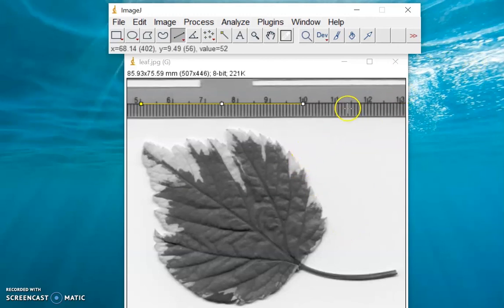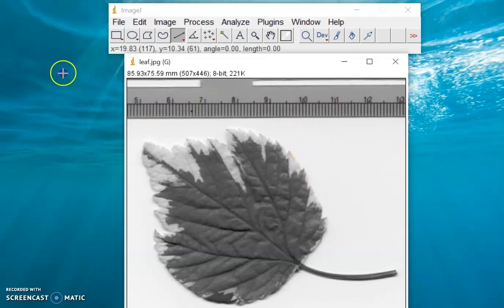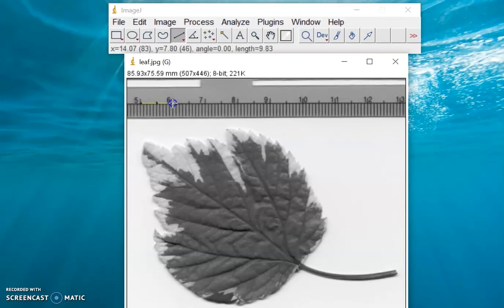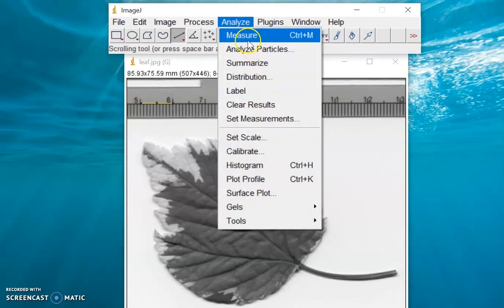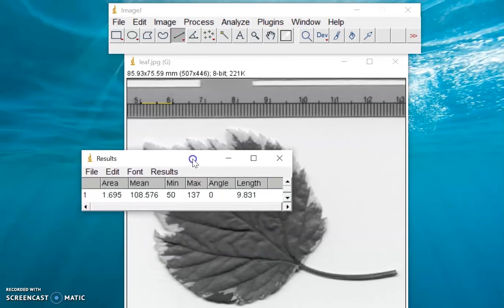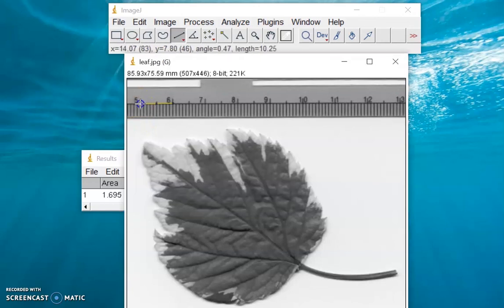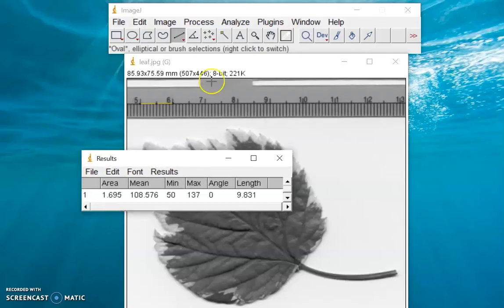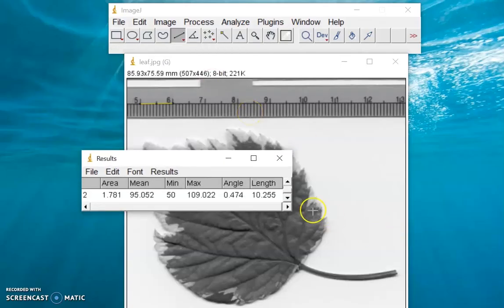So if you try to measure, let's say from 5 to 6 on the ruler and click Analyze > Measure, you'll get a length of about 10 millimeters, which is correct.